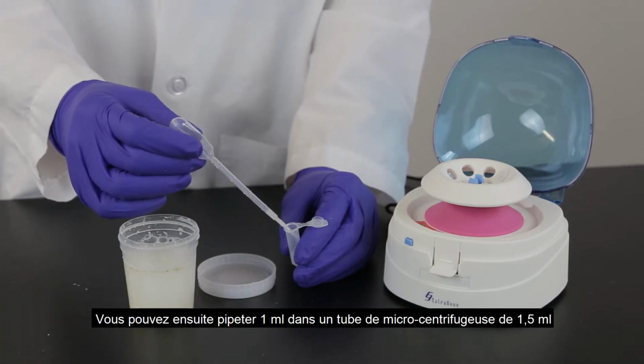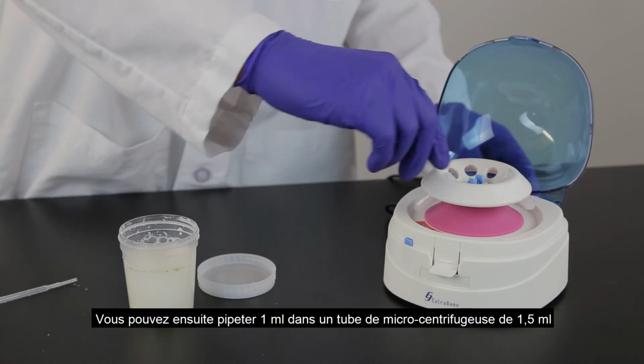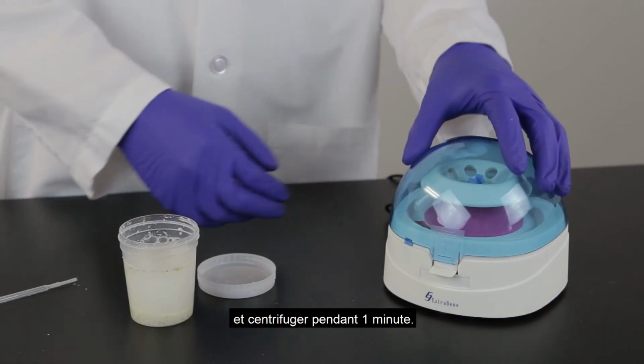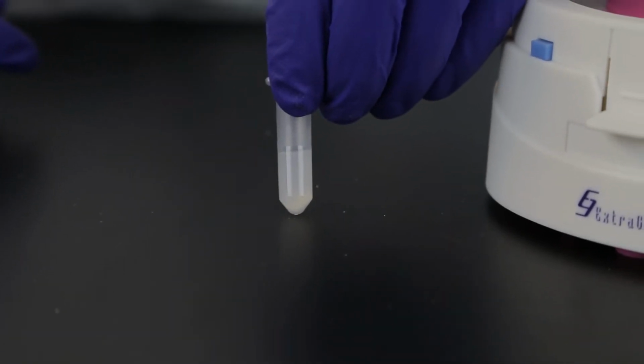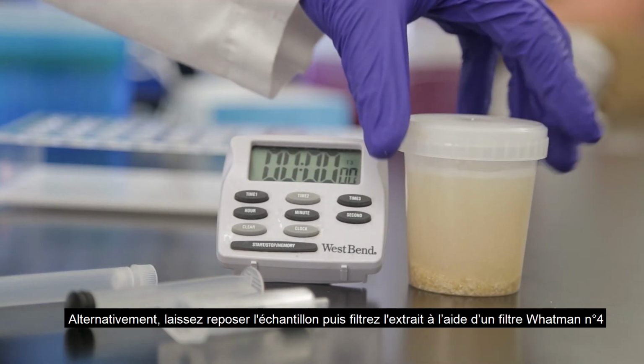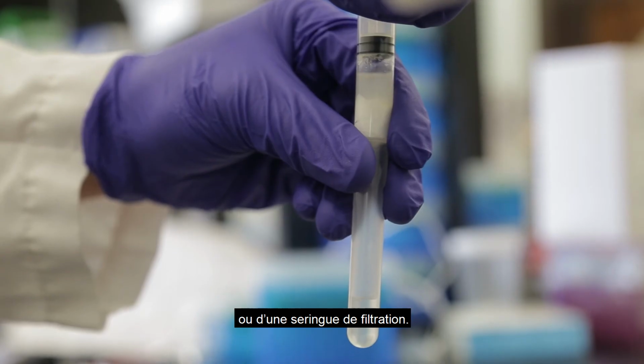Alternatively, you can pipette 1 milliliter of the sample into a 1.5 milliliter microcentrifuge tube and centrifuge for 1 minute using a microcentrifuge. Allow the sample to settle and filter with a filter syringe or Whatman No. 1 filter paper.